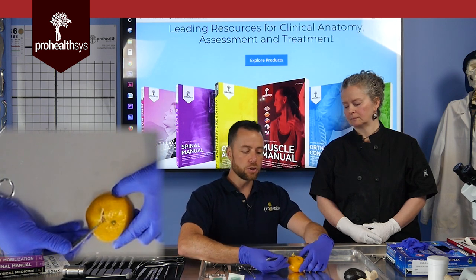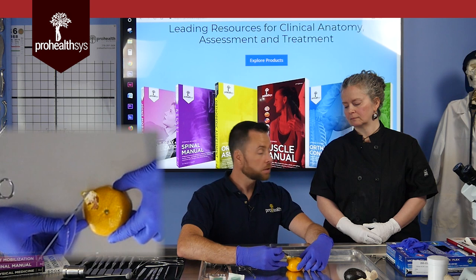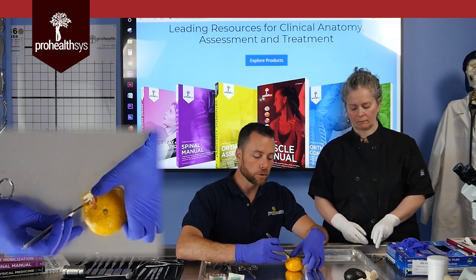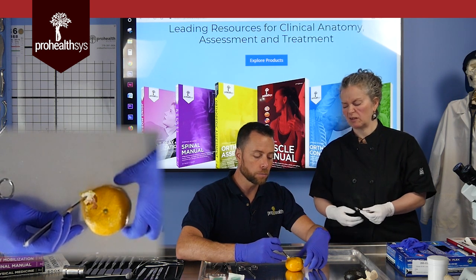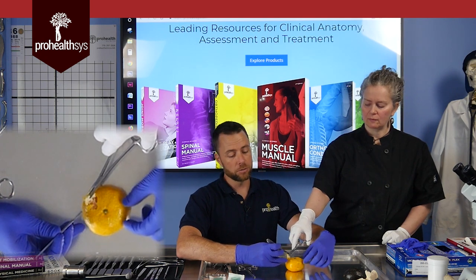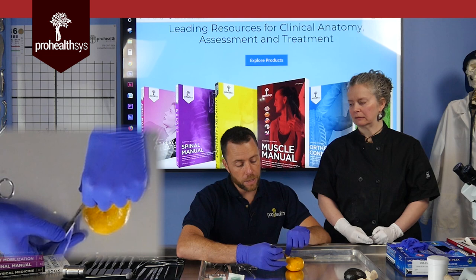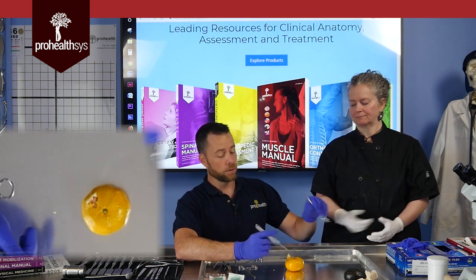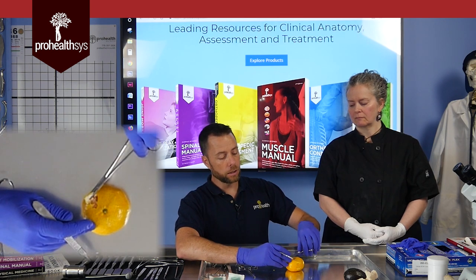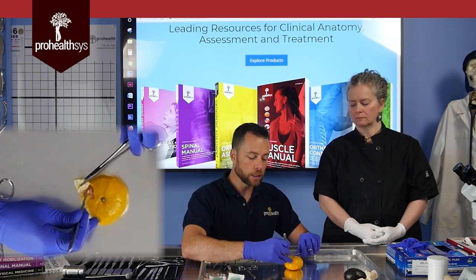In a real cadaver dissection, the tissue on the donor is a little bit more adhered than this orange, with more cross-bridging, but it's actually surprisingly similar in texture and sound, with undulations of the different dermal papillae running up and down as you separate through. You should have a hemostat for finer dissection work. Rather than putting your hand close to the blade, use a hemostat to click and grip, then gently separate through.